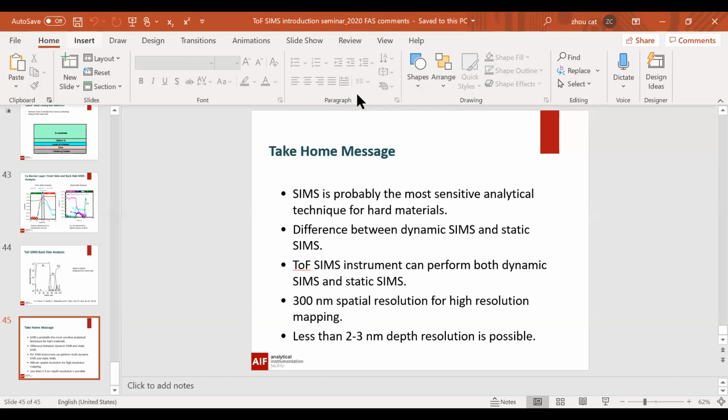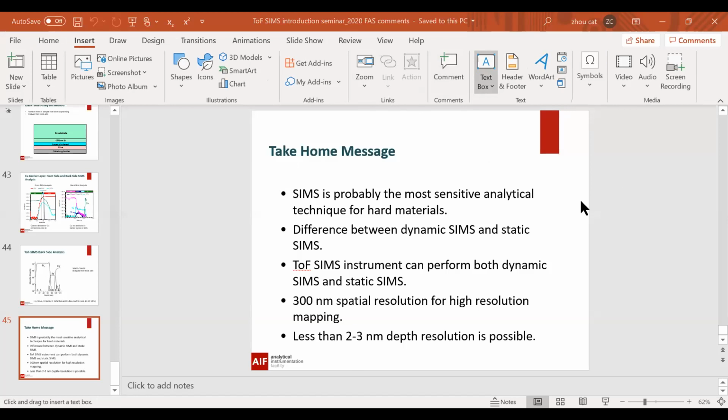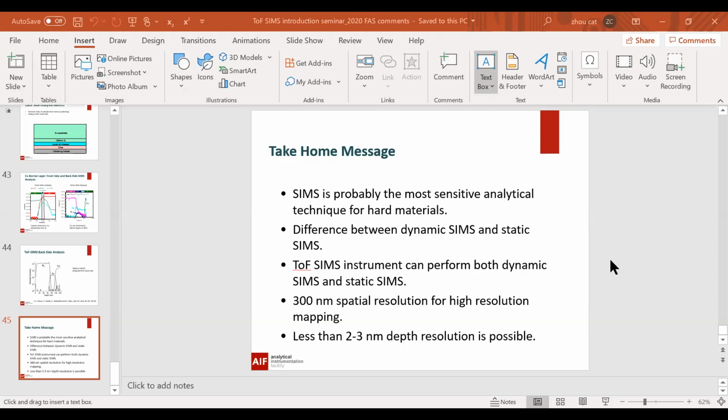Would it be possible to ask a question right now? Yeah, please. This is Tim Spiel, University of Illinois. I've got a Trift 3 from Physical Electronics, so a different type of spectrometer, but same idea. My cesium gun, we originally set it up for depth profiling at about 2 to 3 kilovolts, although the gun can run up to about 15 kilovolts. It seems to me that you get a trade-off. At higher energies, you have a nice flat bottom crater, but at low energies, you have less intermixing. Have you looked at different energies of your cesium gun during depth profiling?